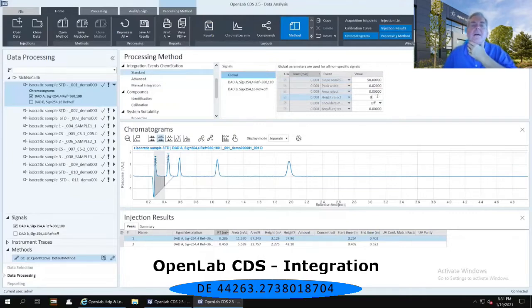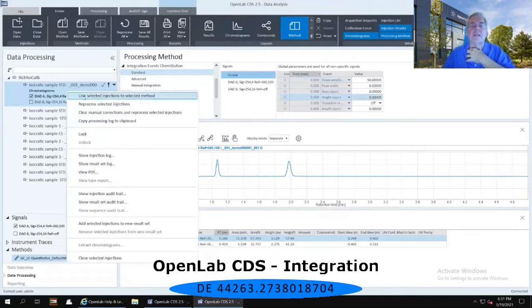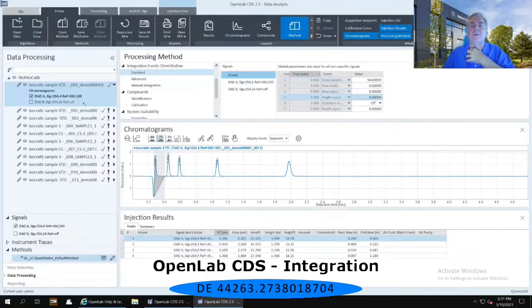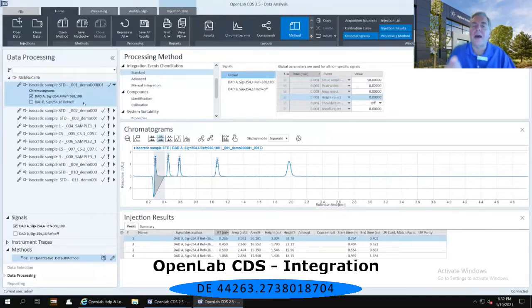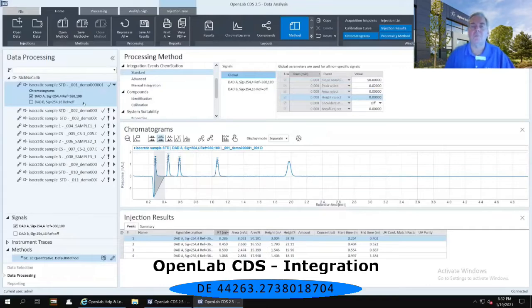I'm going to right-mouse click on the injection on the left-hand side and reprocess that selected injection. Once I reprocess, you'll notice that my first peak — which is really just a solvent peak — is still being integrated. The three main peaks are being integrated, but I've still lost that final fourth peak, which is a real peak that I want integrated. It's not being called by these automated integration numbers.